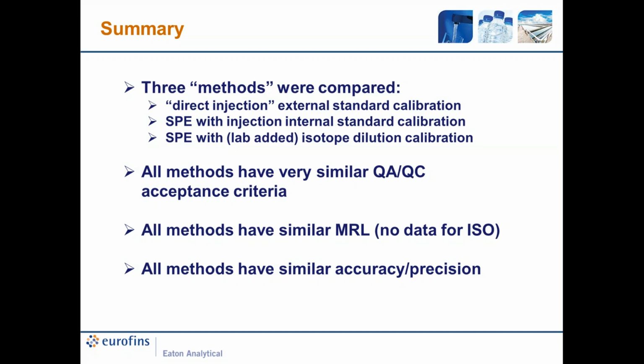LC-MS/MS after SPE or with co-solvation and direct injection has proven a powerful tool in identification and quantification of PFAS using a known list. Methods need to be standardized and modifications discouraged to ensure that data are comparable. Finally, a system needs to be in place that enables more rapid method development and acceptance.